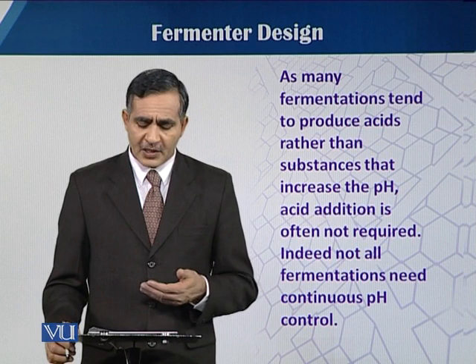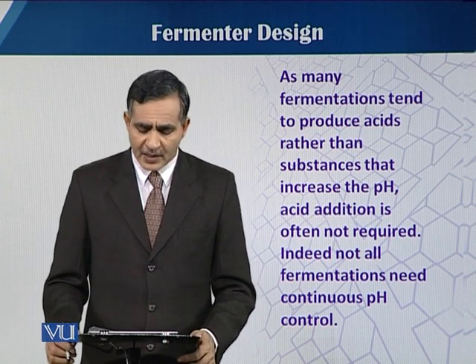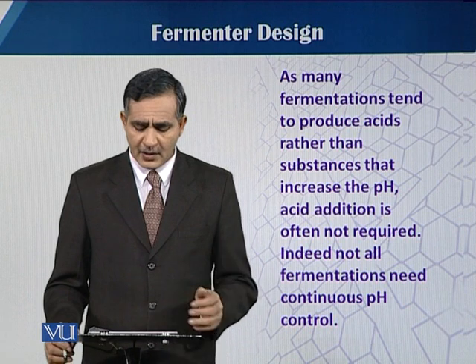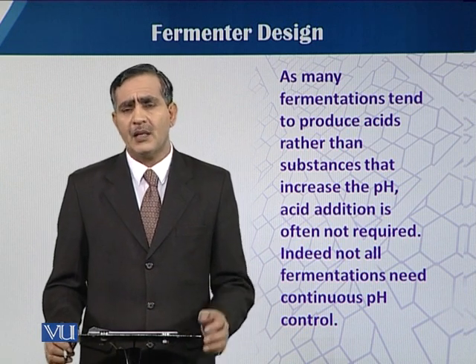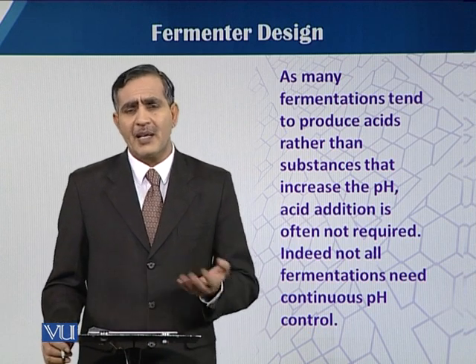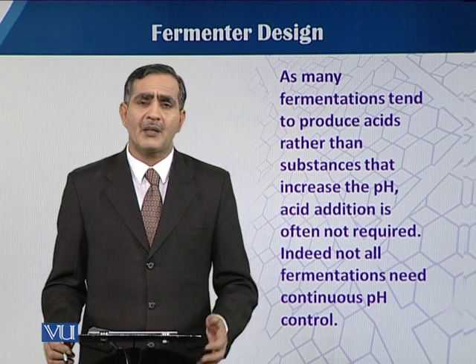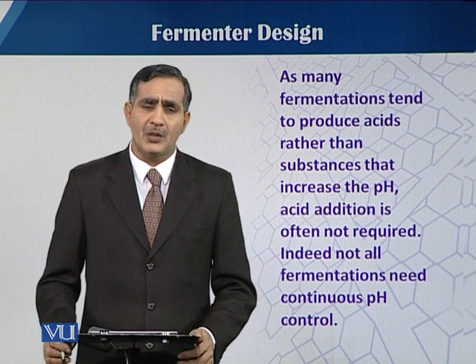As many fermentations tend to produce acids rather than substances that increase the pH, acid addition is often not required. Indeed, not all fermentations need continuous pH control, but in some cases, when our product is directly associated with, or the growth of the organism is directly affected by, the pH change, then the pH control system should be active.